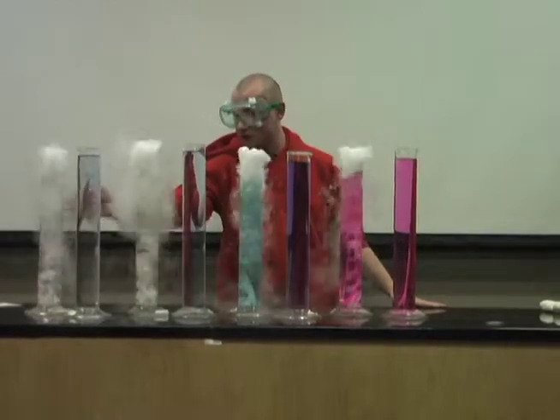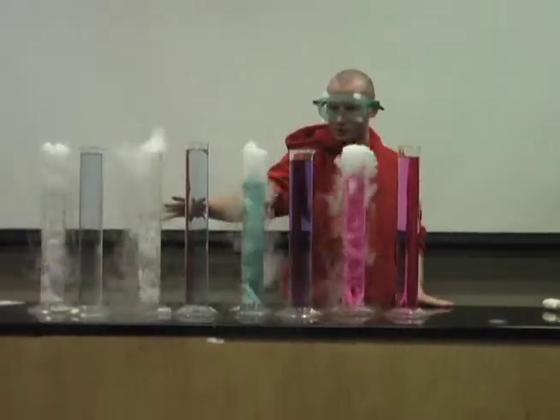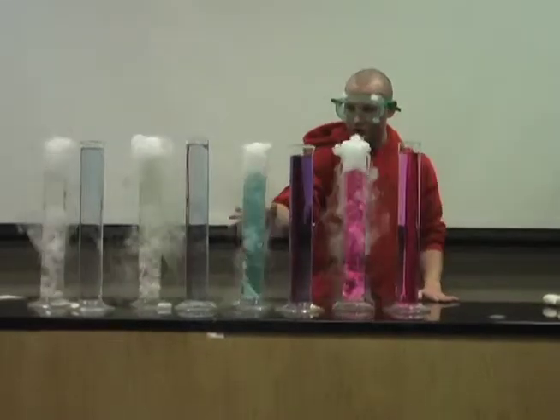We can see that we've gone from a blue to a clear. Here we have sort of the yellow color, and here we have more of a teal color.